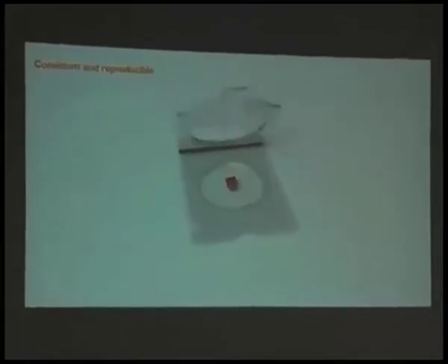This is a short little movie of how a sample is stabilized in the instrument. That's the card, and the sample goes in the card. It's sealed, and as you see, the upper part is dome-shaped.